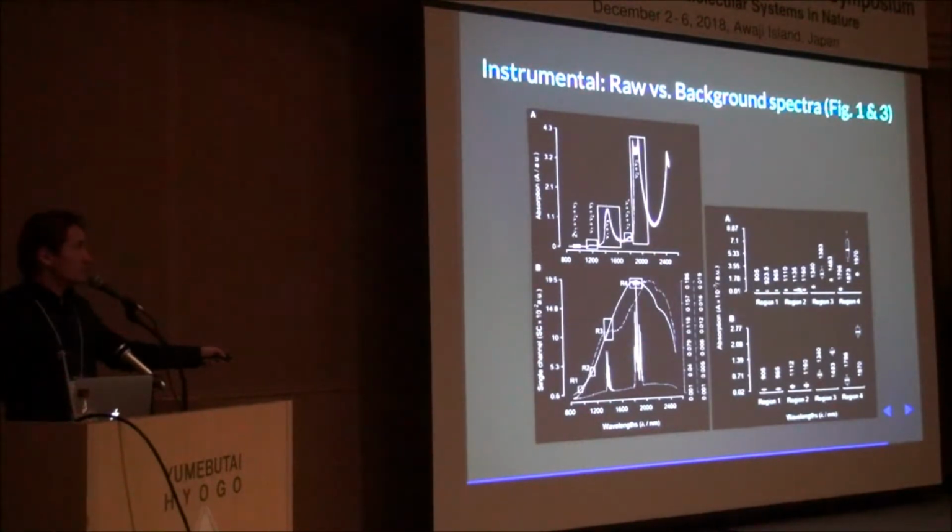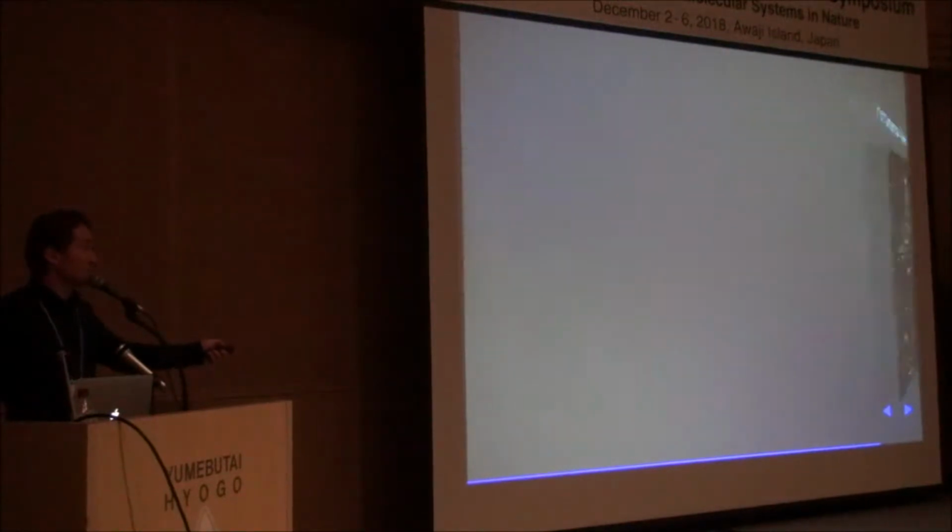These bands are small, but they're small compared to those bands. There are combination bands here. So relative to this absorption, this might not be negligible. But let's just appreciate what we can see here. We see that the variation in the baseline here is about, let's say, 3 to 5, 10 to the minus 3. And I hope I'm successful at passing the message.